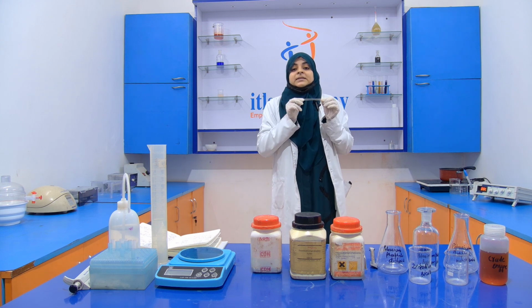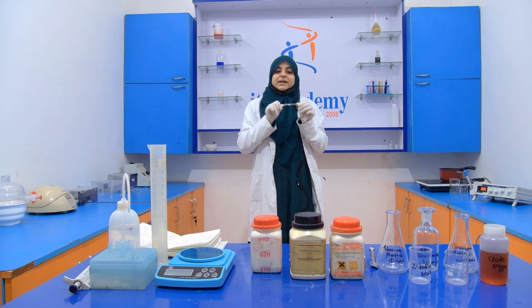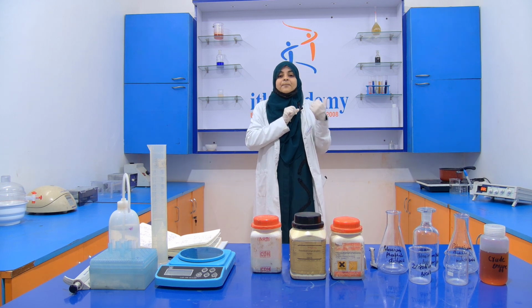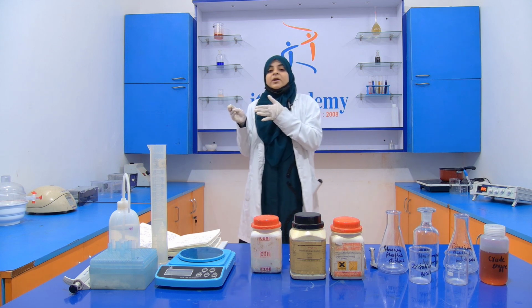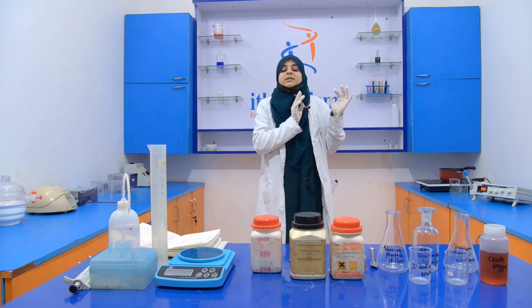This separation takes place through a membrane called a semi-permeable membrane. Dialysis is based on the principle of diffusion, which simply means the movement of molecules from the higher concentration towards the lower concentration.